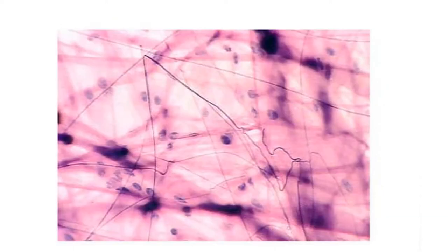Okay, this looks like a blanket I've pulled apart. Lots of space in it, so much space I could drive a truck through it. So a specific type of tissue is loose connective areolar. This is your bubble wrap that provides protection to organs. Why do I see this interesting? These dark black elastic fibers. I see these broader pinky collagenous fibers. And I see the big purple nuclei of the fibroblasts. What's the white stuff in the background? Well, that's considered to be the matrix, or the ground substance. Location, surrounding organs, like bubble wrap.